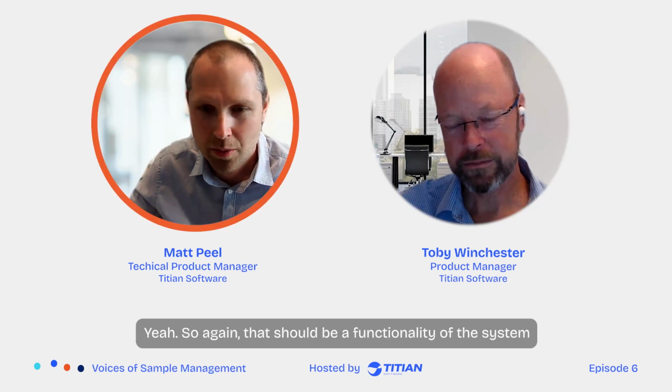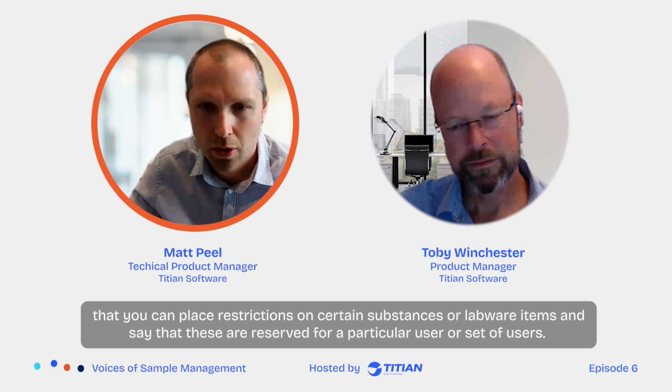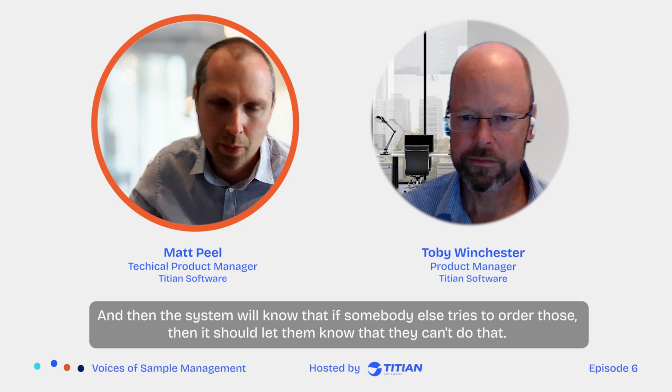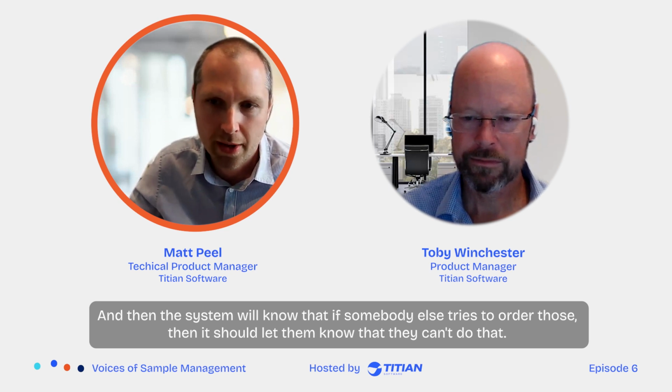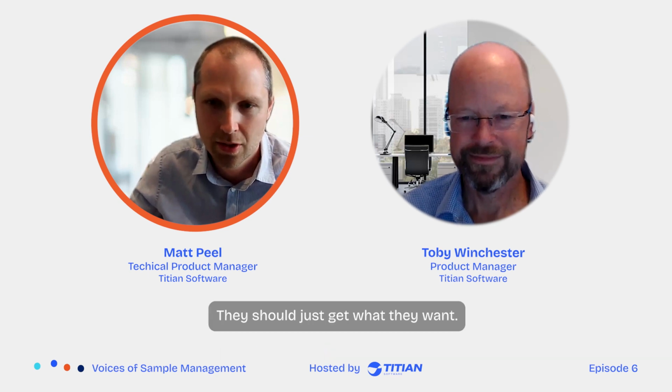Yeah, again, that should be a functionality of the system: you can place restrictions on certain substances or lab items and say that these are reserved for a particular user or set of users. The system will know that if somebody else tries to order those, it should let them know that they can't do that. But it should also know that if someone who is allowed access, they should have access straight away. There shouldn't be any kind of wrangling needed. They should just get what they require.